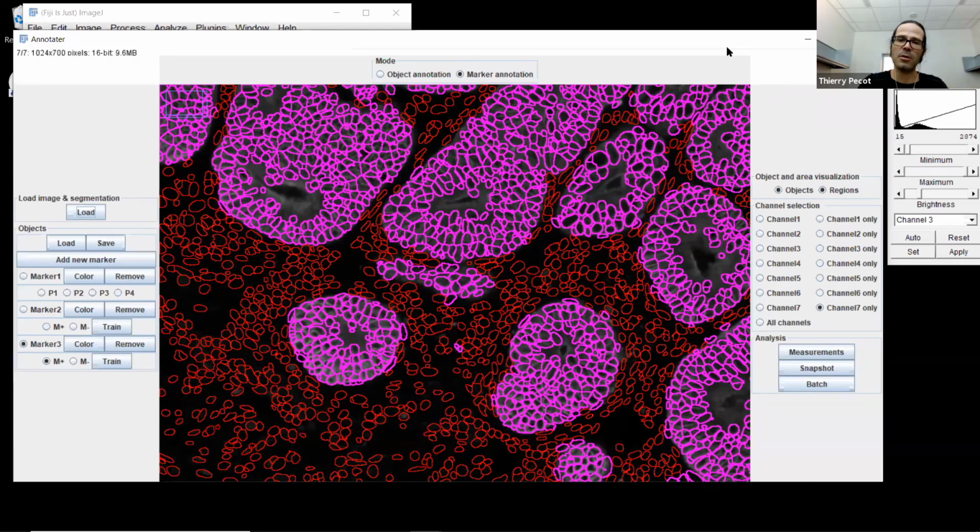So you see here, we had the first part for the manual annotation, so that's good. Ideally in your project, you're going to start by using that to build your training data set. Then you can segment your nuclei. You might be able to segment also the regions. And then when you have all these images, you can go to the marker. I would suggest to use more the logistic regression, the machine learning approach, than the thresholding. But if you like the thresholding and you don't have variations across your images, you can also use the thresholding.